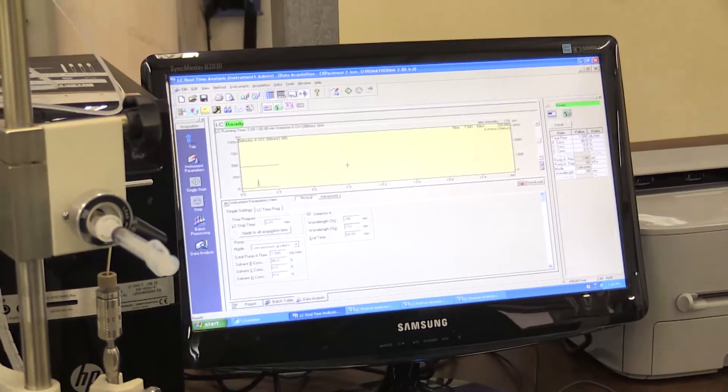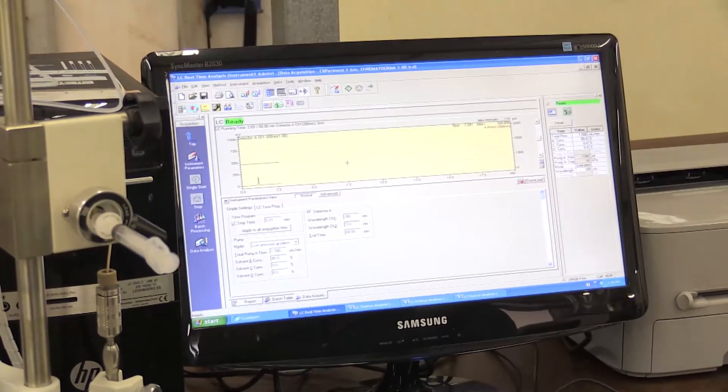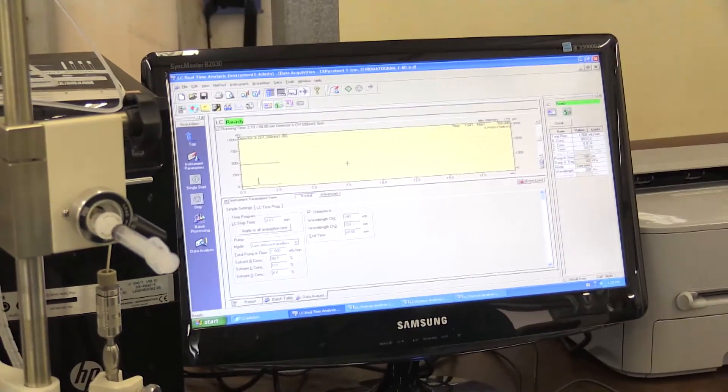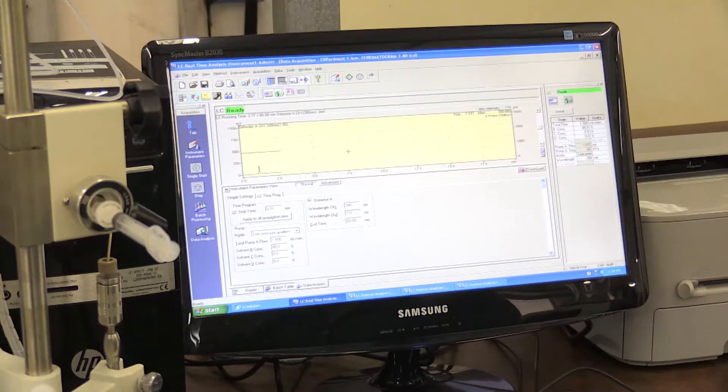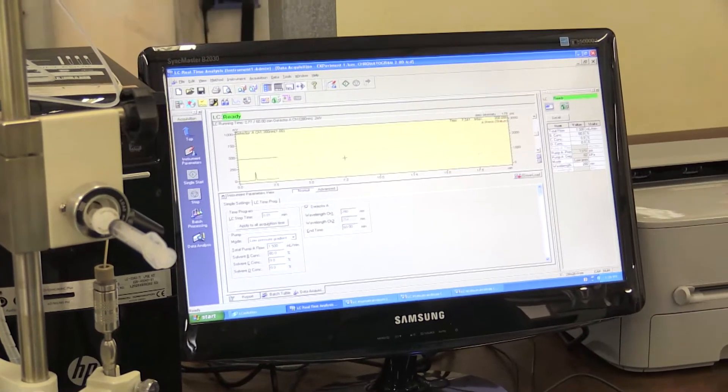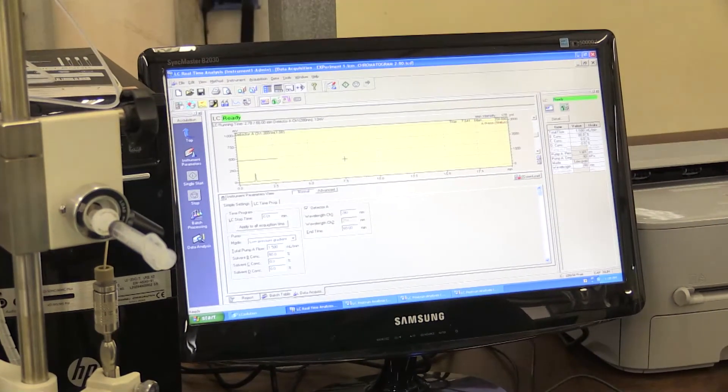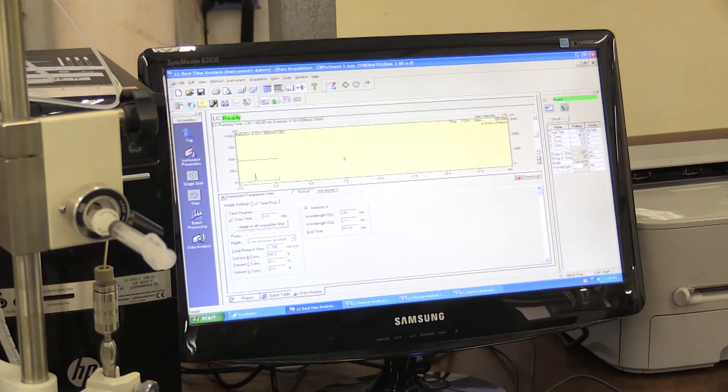At this stage, there is no need to wait 10 minutes because the system has already equilibrated with the mobile phase at 80%.